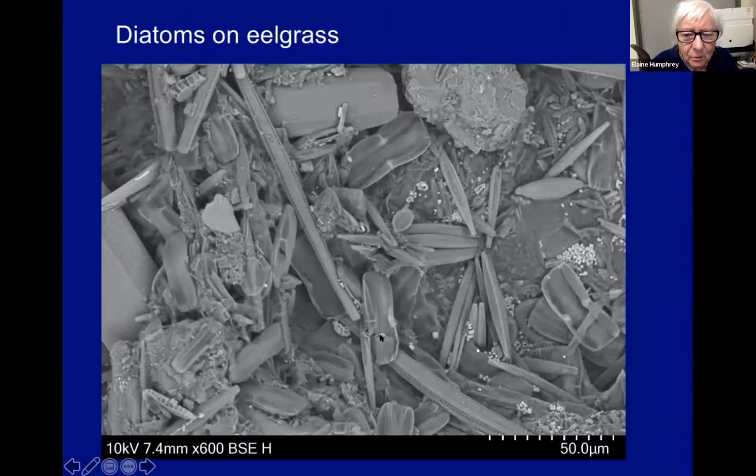And then they come like this, with this folding in them. These ones here have this fold in it, and this one doesn't. See, and this one is bent. It's got a fold in it. Oh, an Achnanthes and an Achnanthidium, something. It starts off ACH. There's an AN and a TH. There's a whole bunch of THs in there. This one here is called an Amphora. I remember that one. And then these long ones are Tabularia. This one's a Tabularia. What else have I got on this slide? Oh, there we are. That's the end.